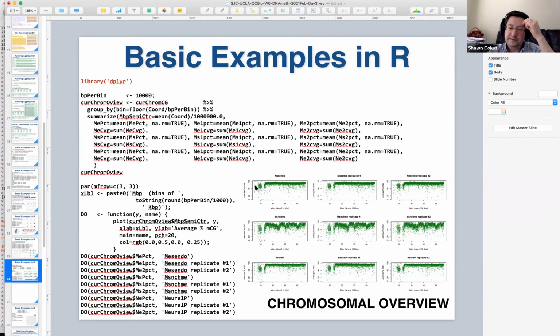So I think this is just, you remember when we looked at the FASTA file, it had all those Ns at the front. I think those last like megabases or something, right? So there's two chunks which are probably poorly represented in the reference. They're just mostly Ns or something. And then there's some sort of transition zone here, which is interesting.